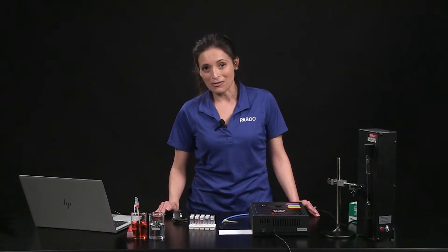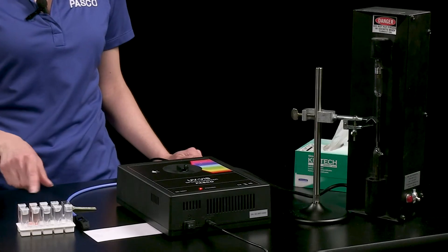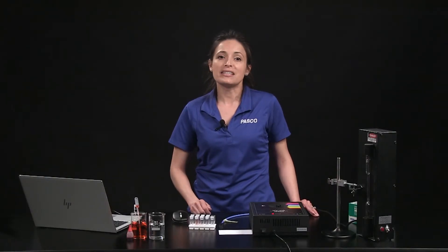Download the latest version of the software from PASCO.com. The spectrometer comes with 10 disposable semi-micro cuvettes usable down to 220 nanometers. The cuvettes come with lids and a cuvette holder. These cuvettes are made of plastic.